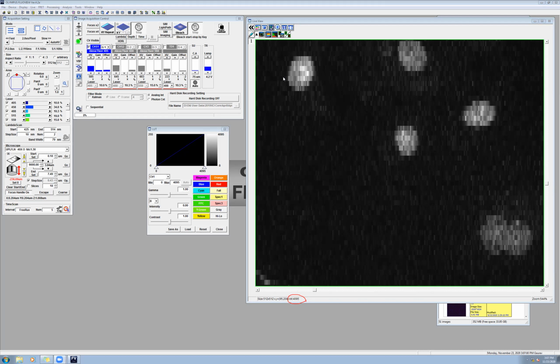Now, this is a 12-bit image, and we talked about bits last time. So the pixel intensity values can range from 0 to 4095, right? So the number of shades of gray that it can have are from 0 to 4095.